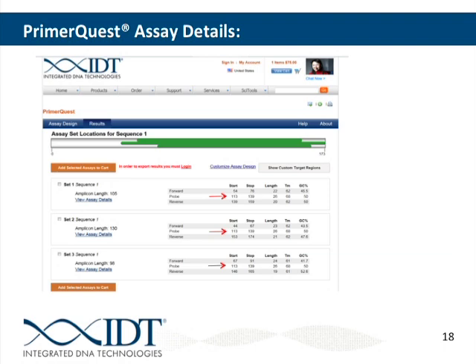So pull up NCBI BLAST. Copy and paste in our forward primer.